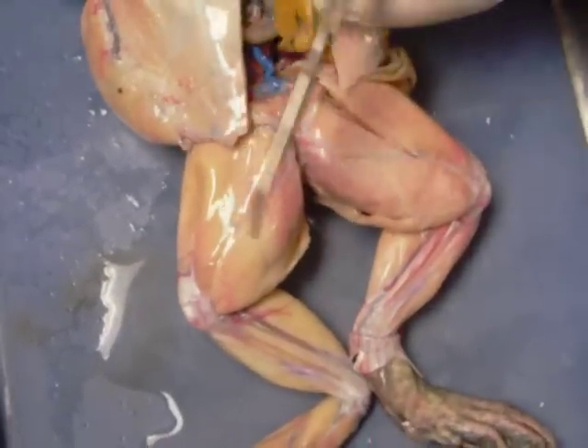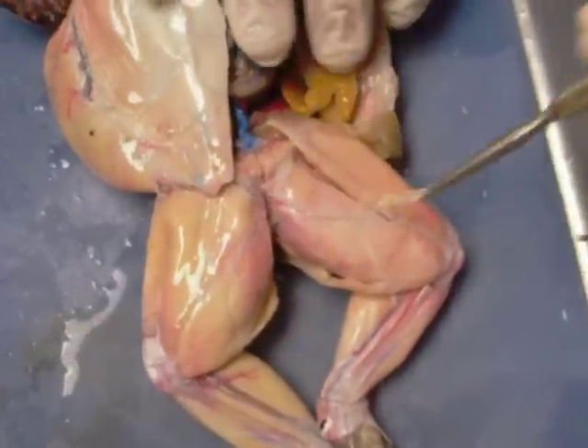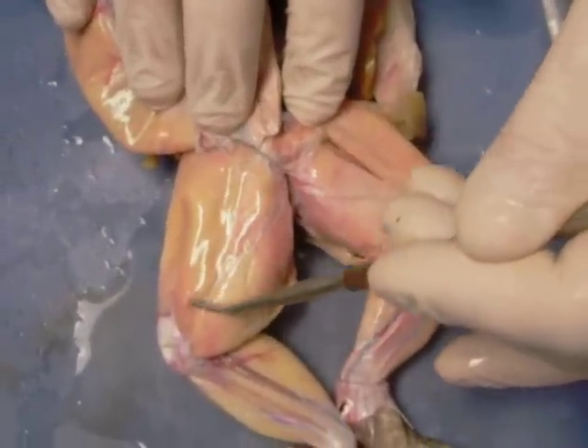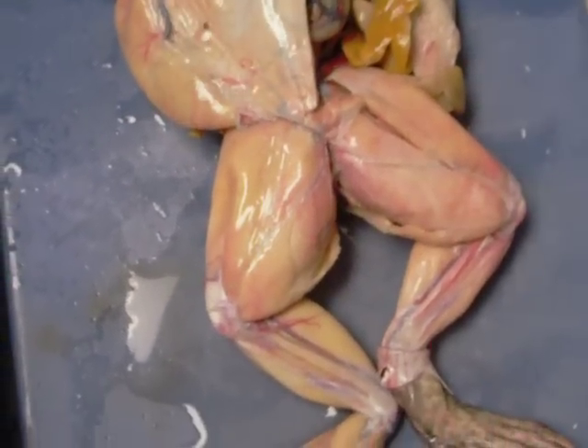We'll flip him over and see his little froggy six-pack. This is the rectus abdominis right down the middle, which has been cut in half. Here we have the gastrocnemius again, and here's the triceps femoris again. And then here we have a muscle that hasn't been well dissected, but you can kind of see the fibers — that's the sartorius. On the backside of the leg is the gracilis major.